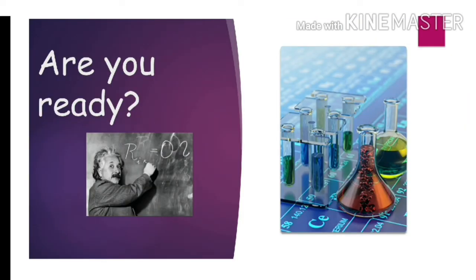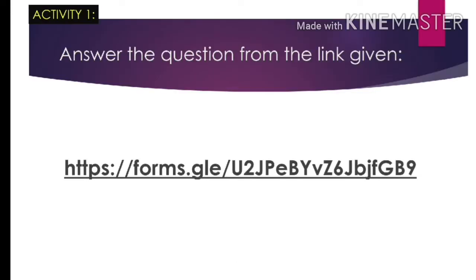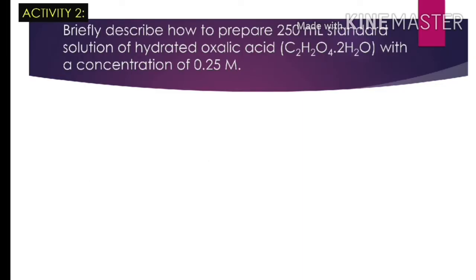So, are you ready for the activities? There are 3 activities for you. Activity 1, answer the question from the link given. Activity 2, briefly describe how to prepare 250 ml standard solution of hydrated oxalic acid with a concentration of 0.25 molar.